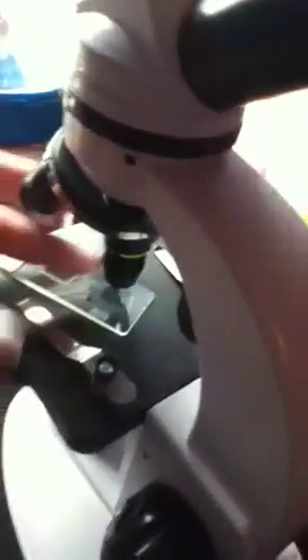That's the Betta Bite under there. For those of you who don't know what Betta Bites are, this is the Betta Bites.